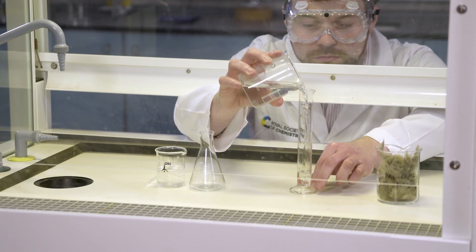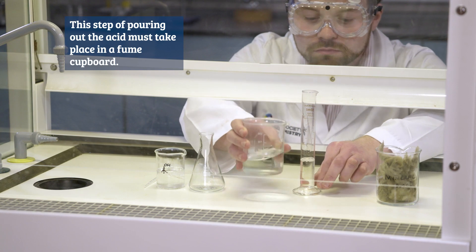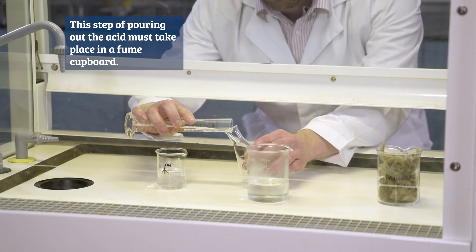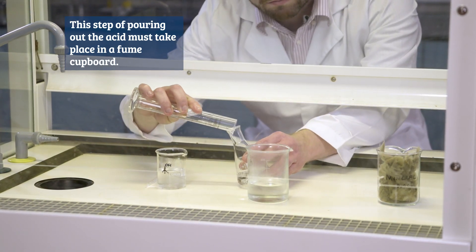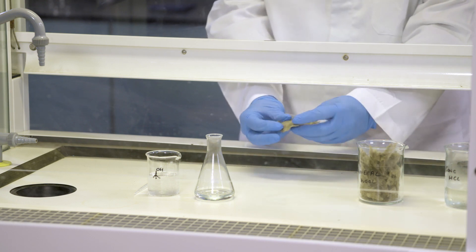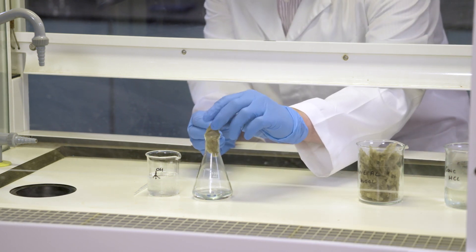I'm going to start by measuring out 20 centimeters cubed of concentrated hydrochloric acid and pouring it into a conical flask. Use mineral wool to plug the neck of the flask. You can also use cotton wool for this.